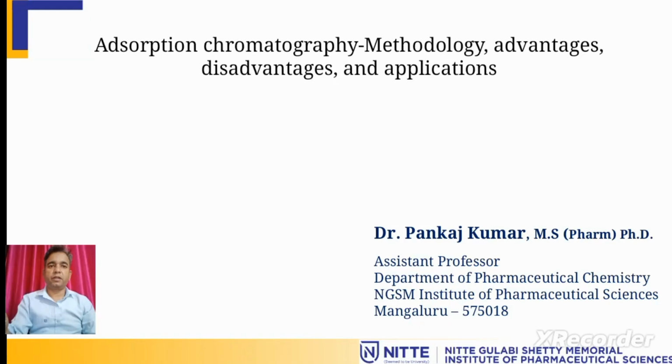Today we are going to learn about the science of chromatography. In this technique, we will learn about the different methods of separation of a mixture of compounds. Chromatography is important because it is a technique through which we separate a mixture of compounds into individual compounds. The individual compounds have different properties, which can be evaluated individually.